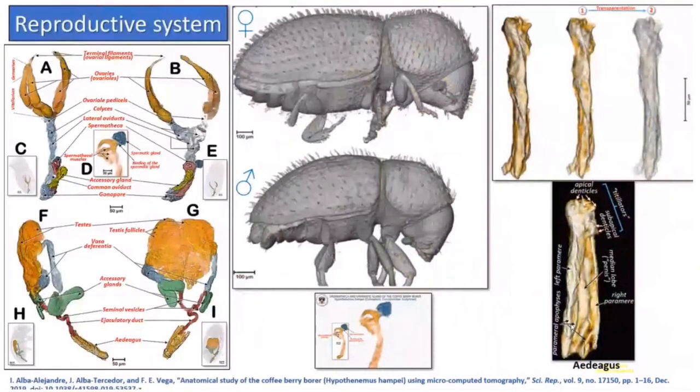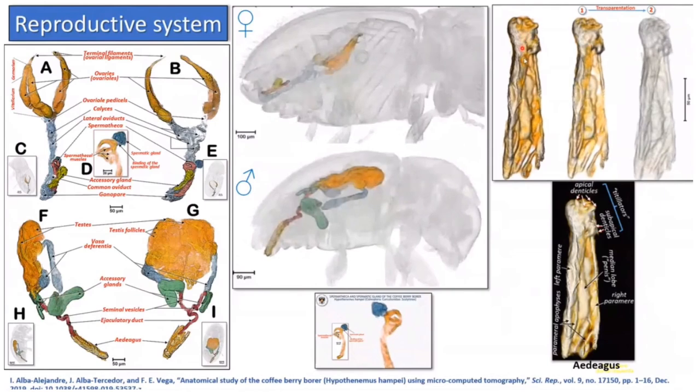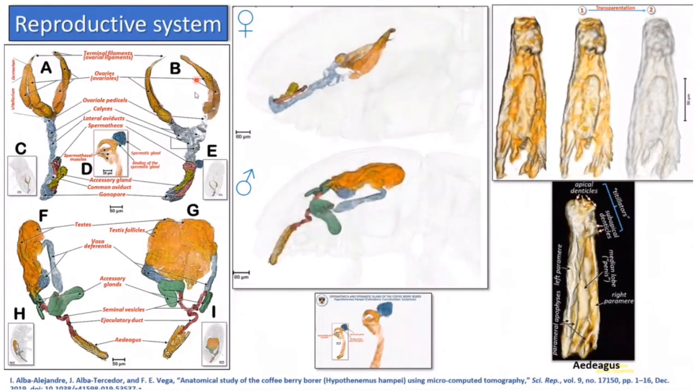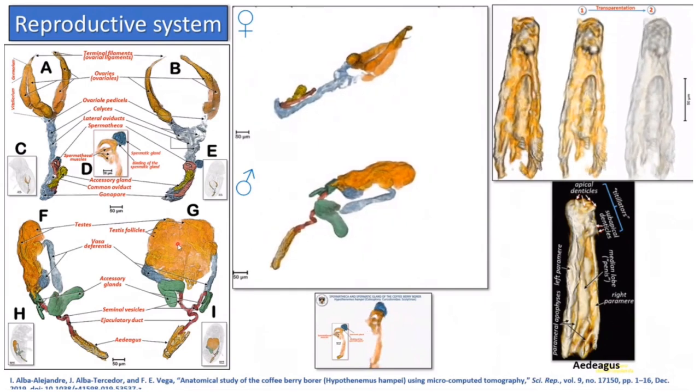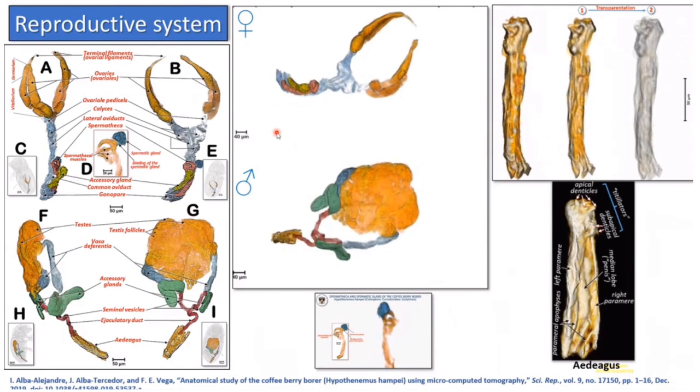Or even studying the reproductive system, we could describe the areas and look at all the organs in the way that we knew from entomology, but in a special way because it has not been deformed by preparation.